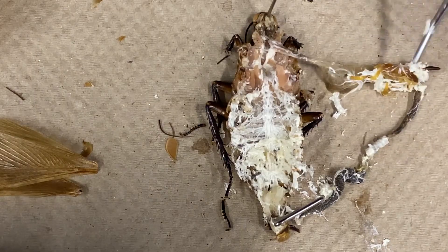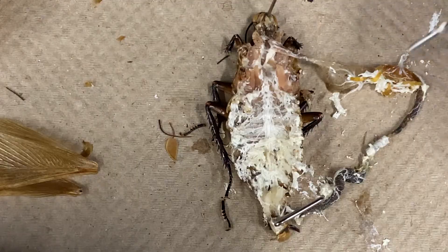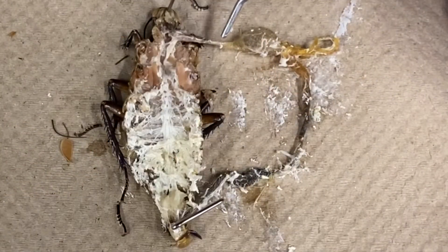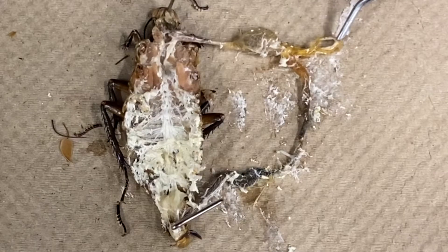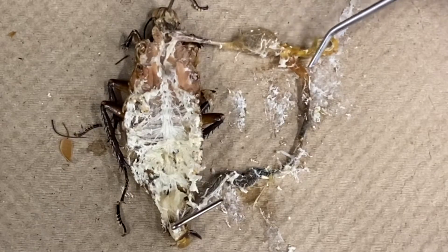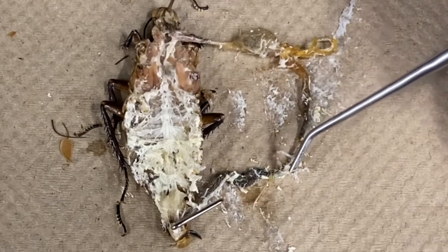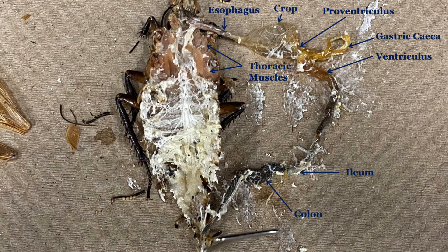Now that the dissection has been completed, you should be able to identify the various parts of the digestive tract. These parts include the esophagus, crop, proventriculus, gastric ceca, ventriculus, ileum, and colon. At this point, your dissection is complete, but feel free to continue to examine your specimen and see what else you can identify.